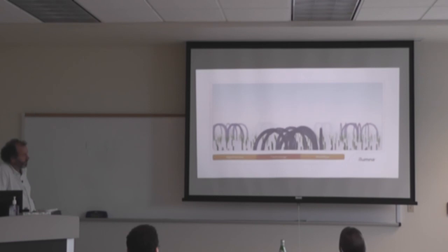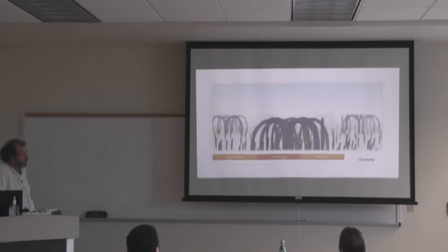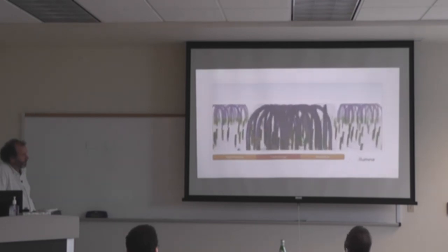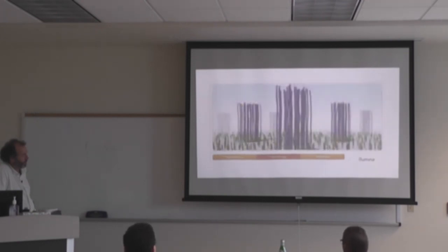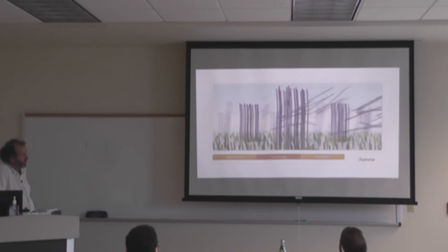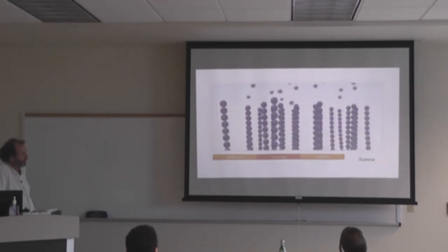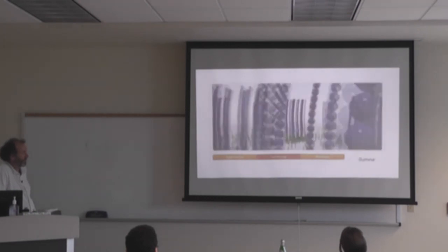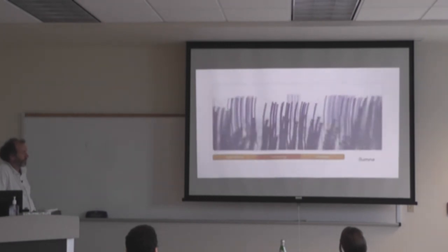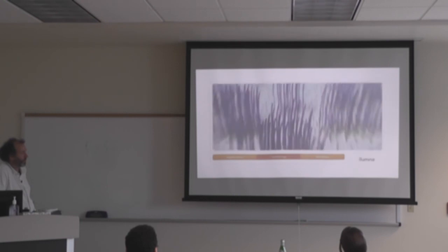Each library fragment is clonally amplified through a series of extensions and isothermal bridge amplifications, resulting in hundreds of millions of unique clusters. The reverse strands are cleaved and washed away. Ends are blocked, and a sequencing primer is hybridized to the DNA templates. After cluster generation, the libraries are ready for sequencing.